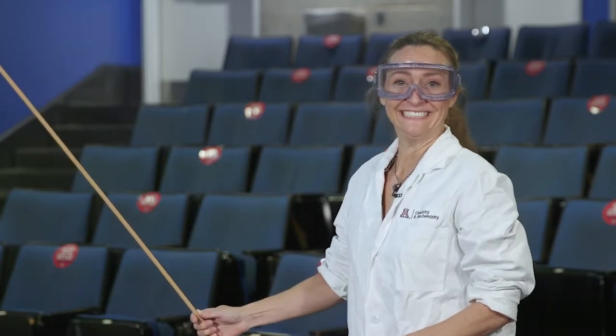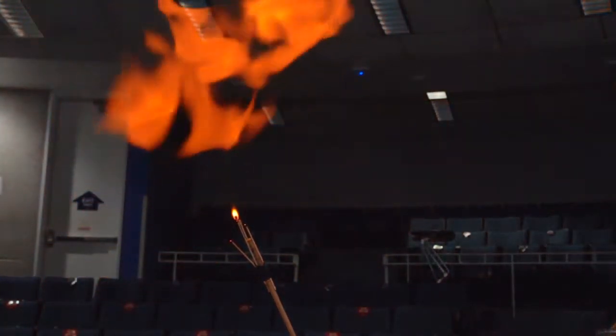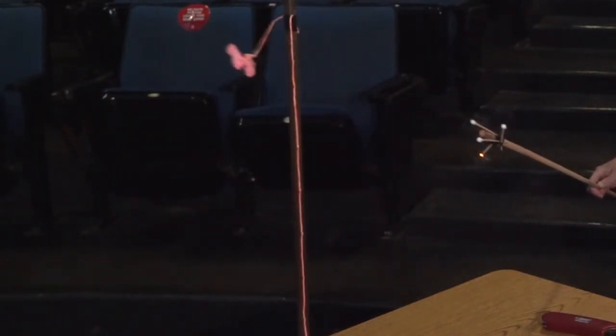Not inert. So some of you may have heard of the Hindenburg. That is why it's a little dangerous to have hydrogen in a gigantic volume floating around where lightning strikes happen and sparks, etc. So hydrogen, as we just saw, is extremely combustible. Now, why is it that hydrogen actually reacted when nitrogen didn't?